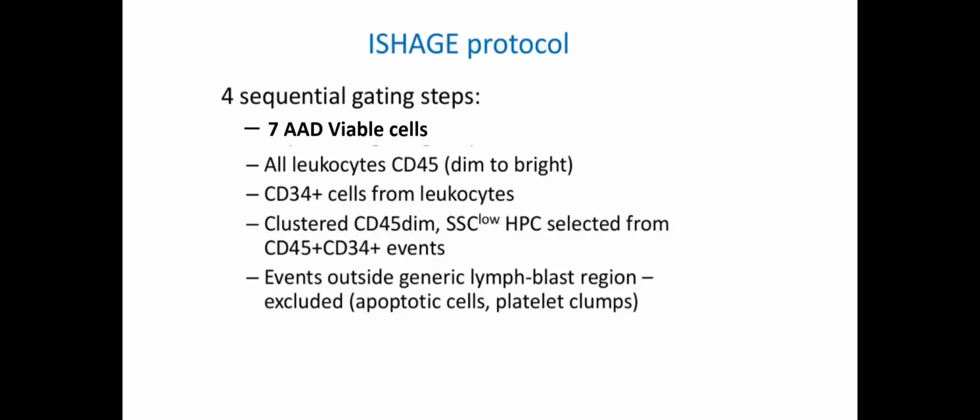We have come to the analysis session of our workshop. In this we'll cut into three parts. One is analysis of cell, that is defining of hematopoietic stem cells. Second is defining of beads, and third one is a calculation of hematopoietic stem cells enumeration.